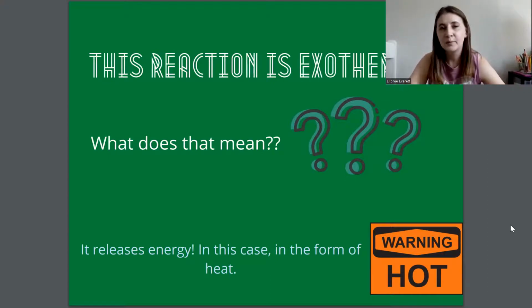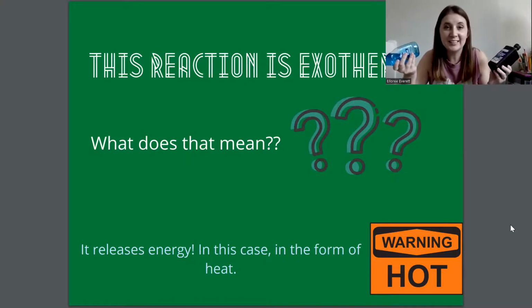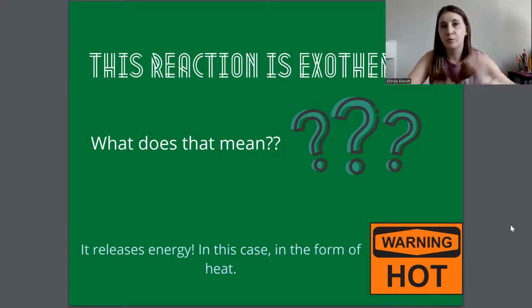Now, not boiling hot, it won't burn your hands or anything, but it will feel pretty warm to the touch. So make sure after you do your reaction that you feel its heat, because it's pretty cool. An exothermic reaction naturally releases heat. So a reaction using liquids that are not particularly hot put together will feel really hot. So that's pretty cool. Alrighty.